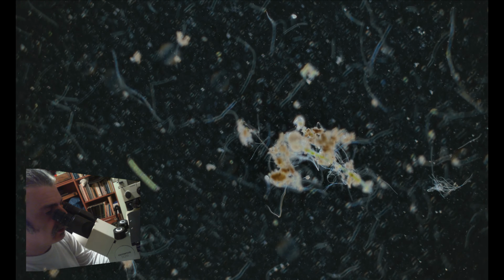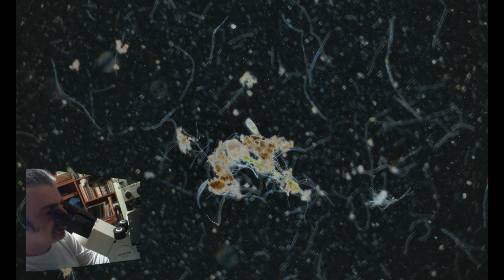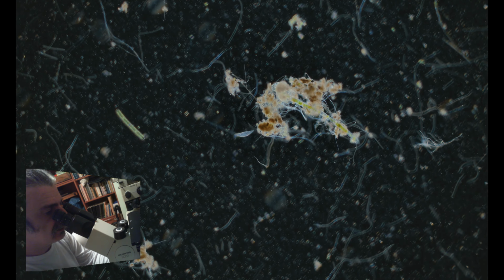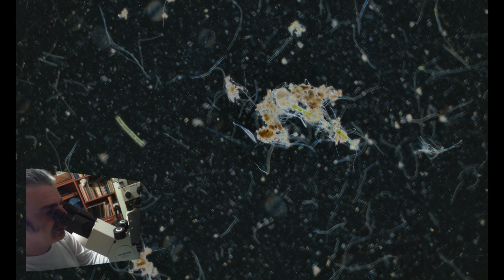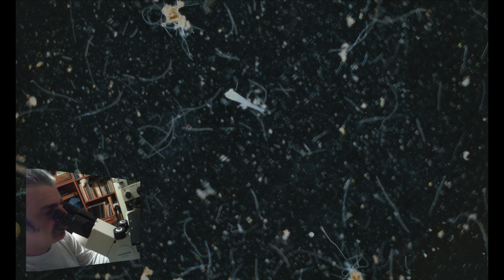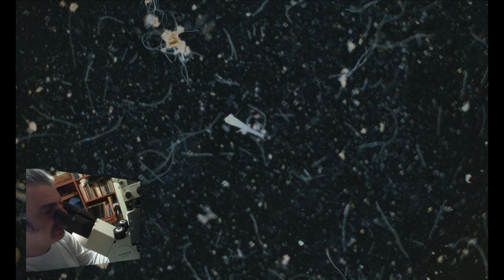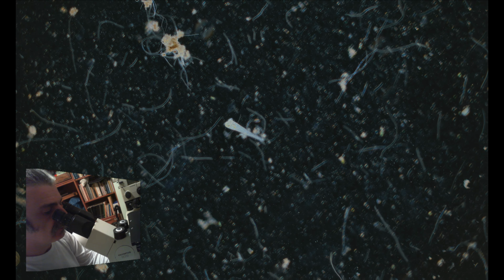Here we can see in the middle a Euplotes, which is a ciliate, a single-cell organism. Here is another ciliate, from the genus Lytonotus. Don't worry about the names, they're not important. You can just admire those creatures. Here is another ciliate called a stentor, and stentor in Greek means a trumpet. You can see its body resembles a trumpet.